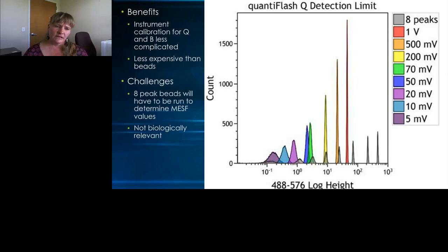However, there are some challenges. If you want to determine MESF on your system, you have to make sure to run 8 peak beads, and it is not biologically relevant.